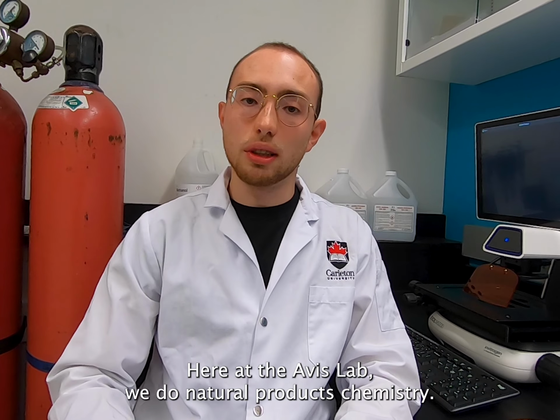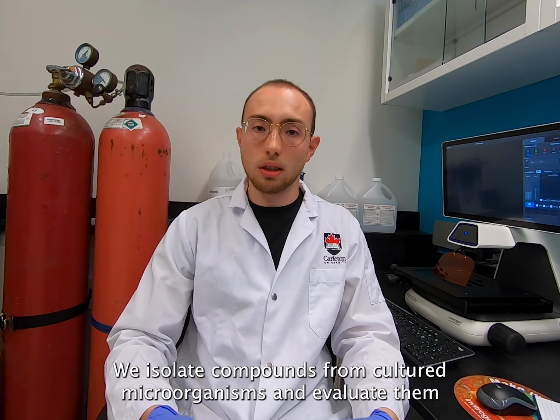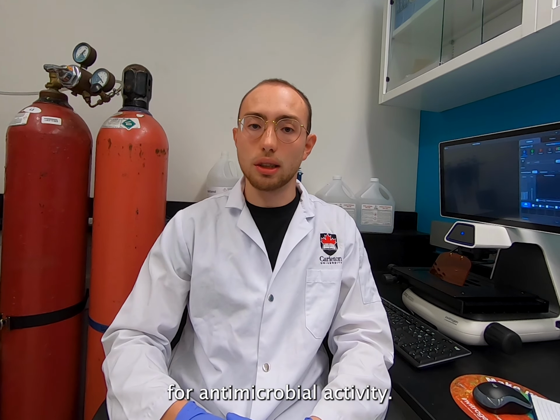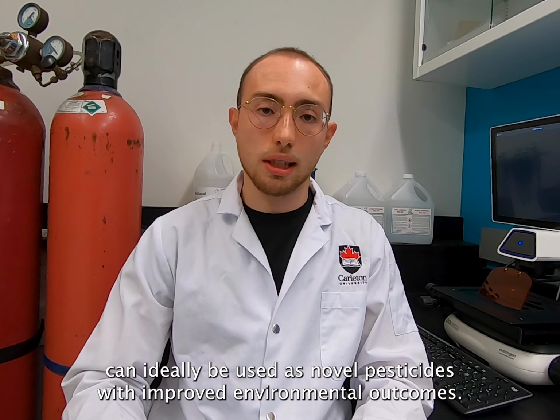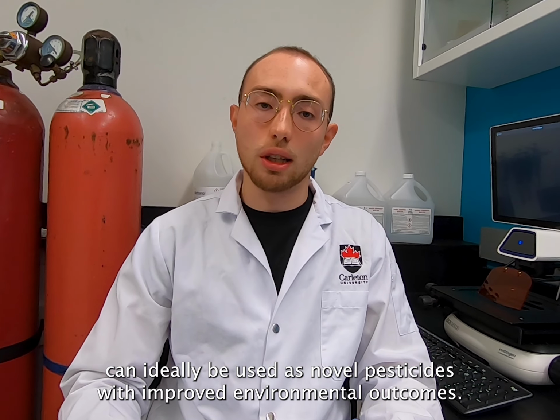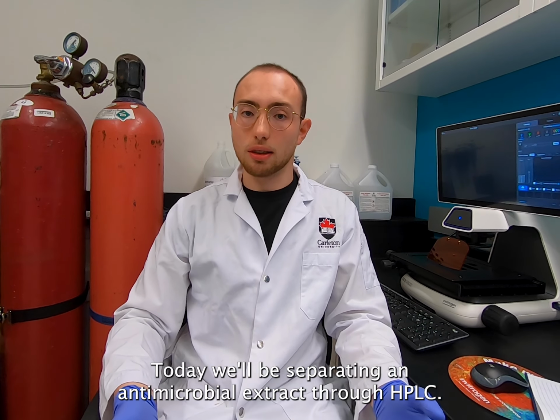Here at the Avis lab, we do natural products chemistry. We isolate compounds from cultured microorganisms and evaluate them for antimicrobial activity. The antimicrobial compounds we find can ideally be used as novel pesticides with improved environmental outcomes. Today we'll be separating an antimicrobial extract through HPLC. Come on, I'll show you.